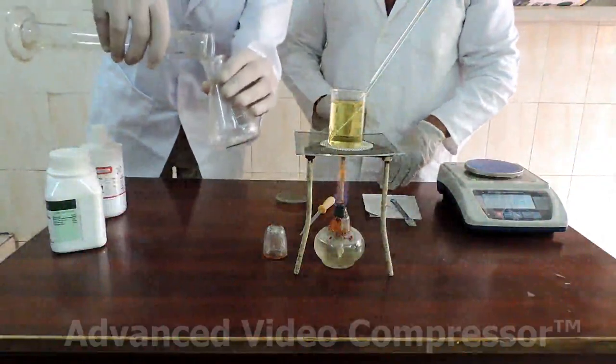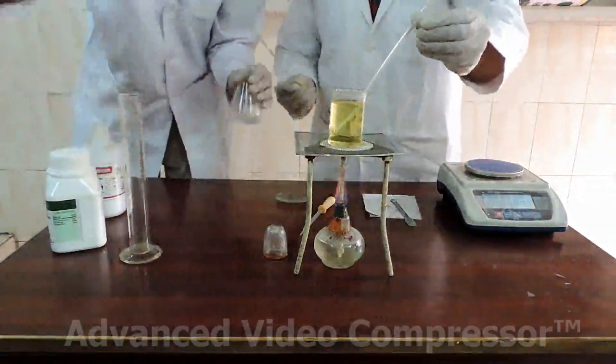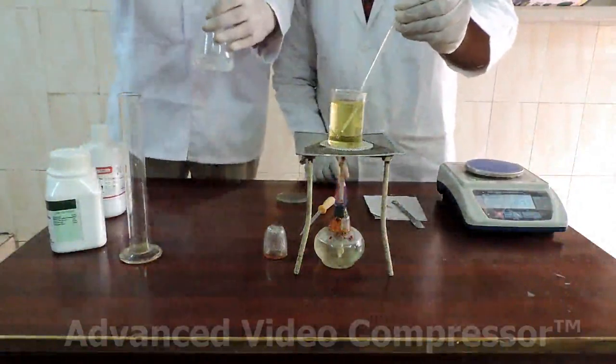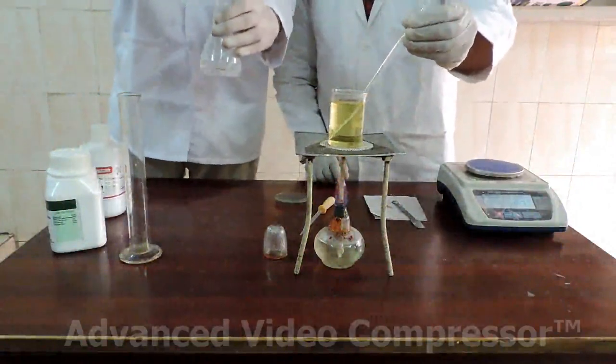Now we add ethanol into potassium hydroxide and stir it thoroughly. We check the temperature of the oil which is 60 degrees Celsius.